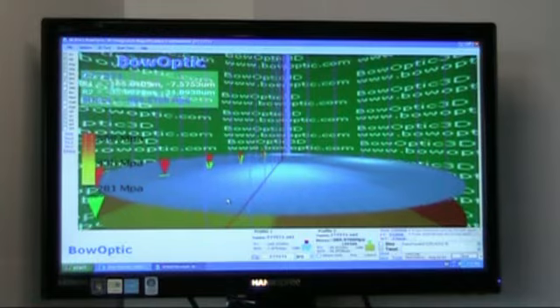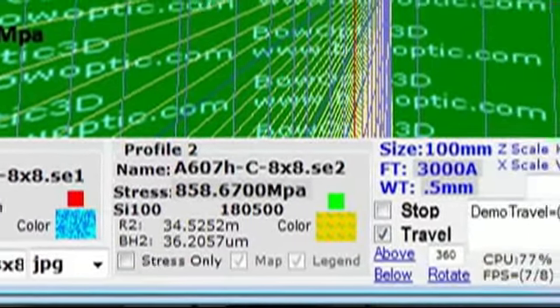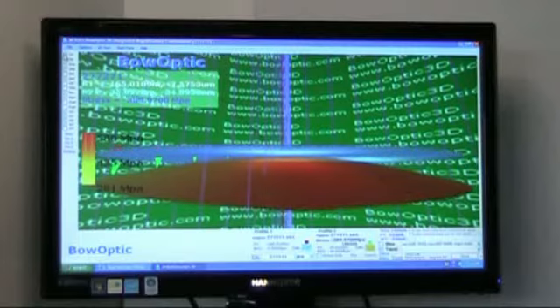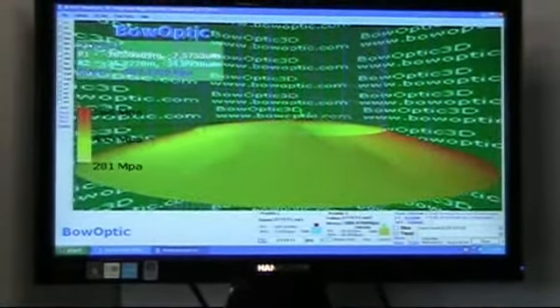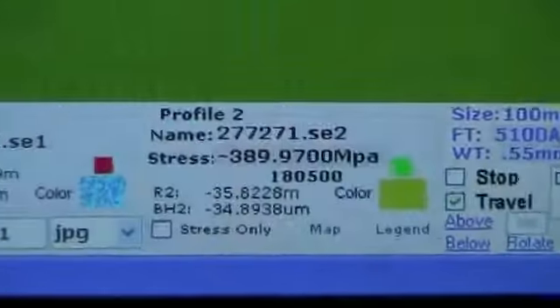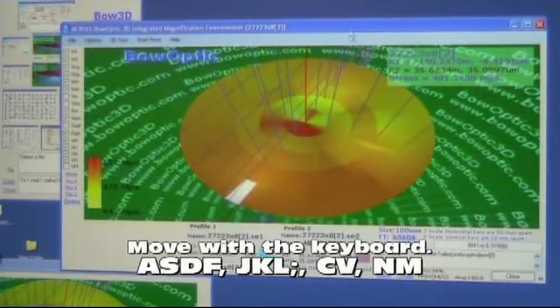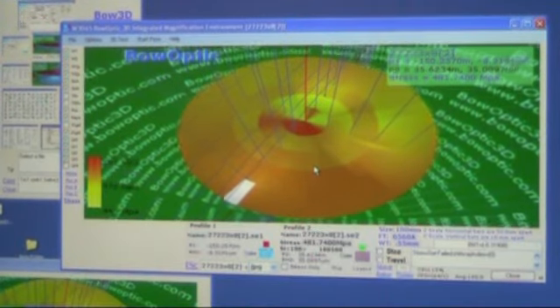I can make it full screen. There are many tools in W3D65. The controls are on the left and bottom of the 3D form. I can disable images with the controls. Information about the scan is on the bottom of the form. Use the keyboard to move with ASDF and JKL:. Use Help on the control bar for more information about keyboard movements.